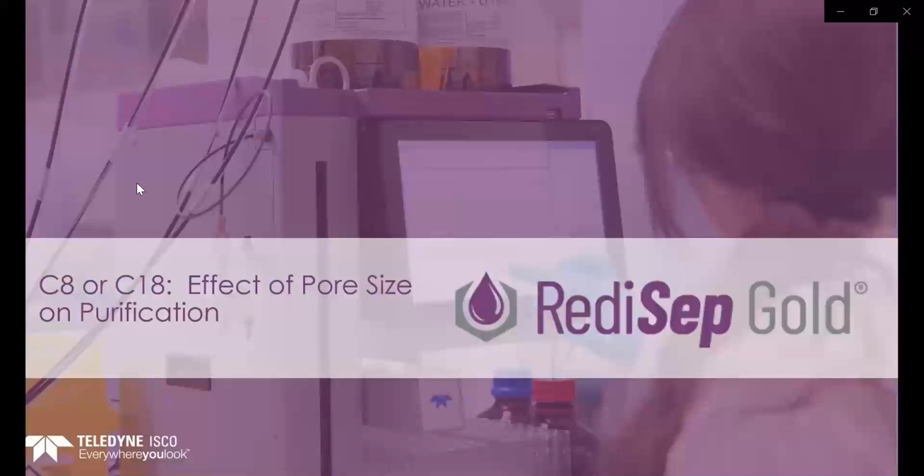So now we're going to move into our alternative medias. Specifically, we're going to focus on C8 and C18 and the differences in choosing between the two of them. And we're going to talk about pore size on our purifications first.